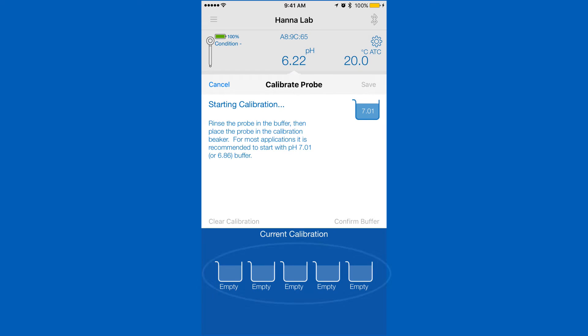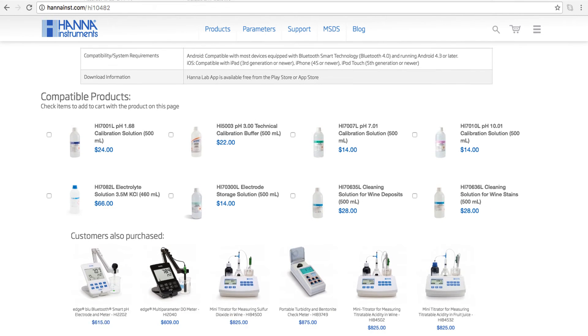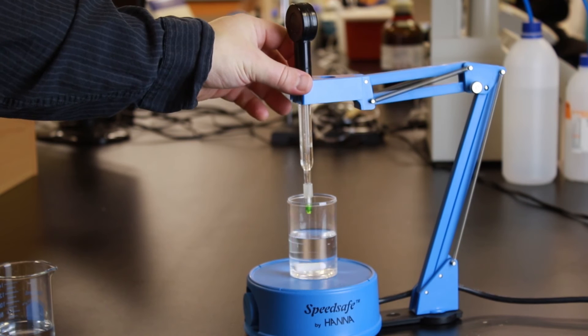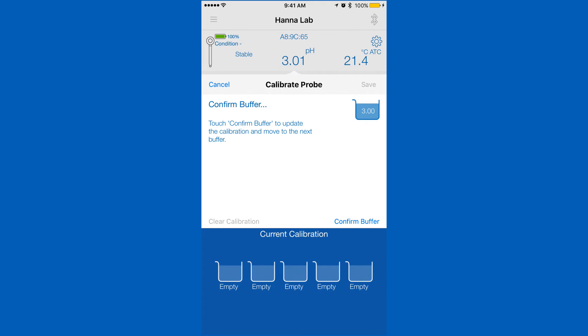Your Halo can calibrate up to 5 points that are automatically recognized. For wine, we recommend calibrating to pH 3 and 7.01. You can find all the calibration solutions you need right on the product page. Rinse and place your probe in your pH calibration solution and wait for a stable reading. Once stable, tap confirm.